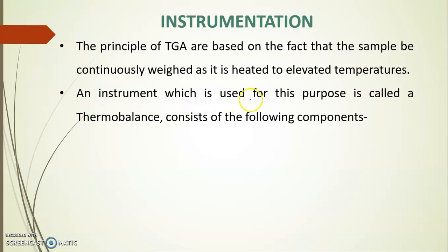An instrument used for this purpose is called a thermobalance, which consists of the following components.